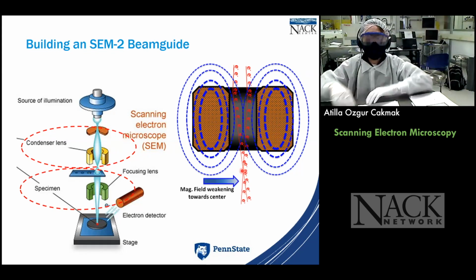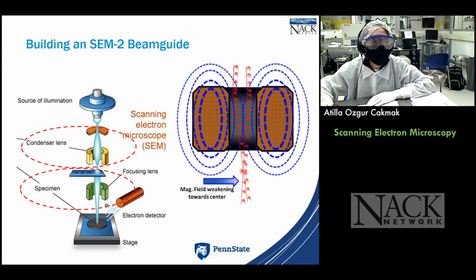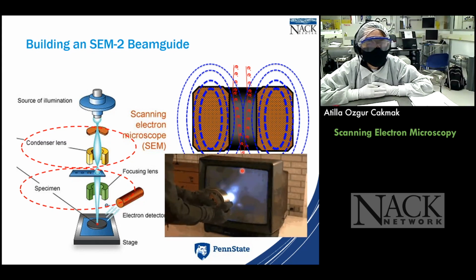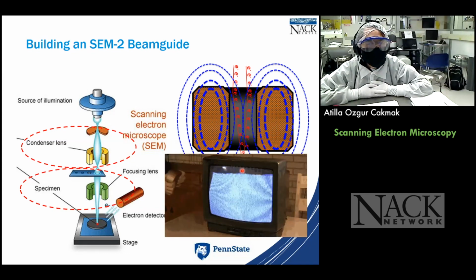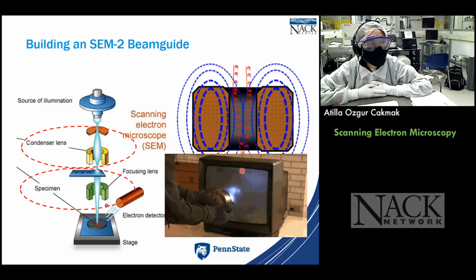But enough about this discussion. When I show this to my students, and hopefully you will do as well, they immediately understand the idea. This is an experiment that I also carried out when I was 6 years old, and my father, of course, got quite angry at me. Get a magnet and put it closer to a CRT television, where you're also releasing electrons to get the image, right? And the magnet will be able to focus or deflect or guide, whatever you would like to do, the electron beam. So this is how the SEM will also work, to guide the electrons.